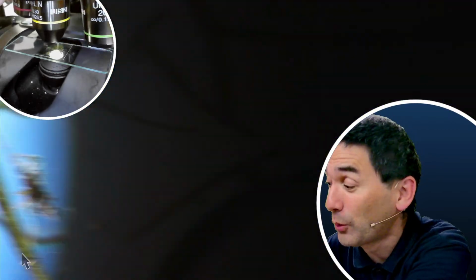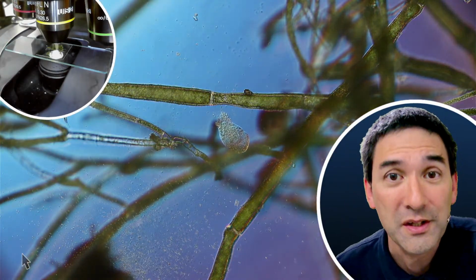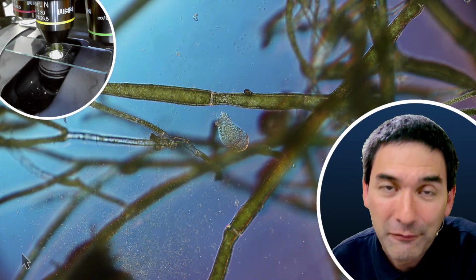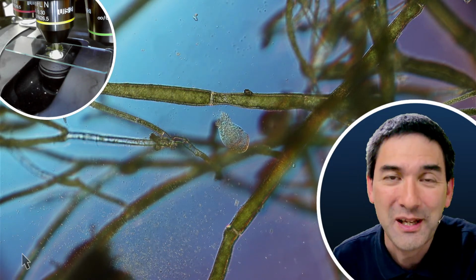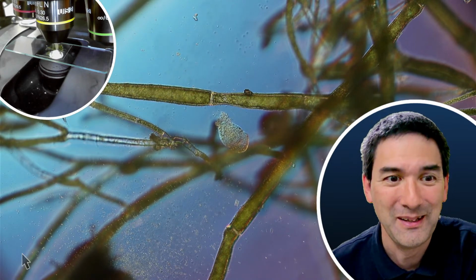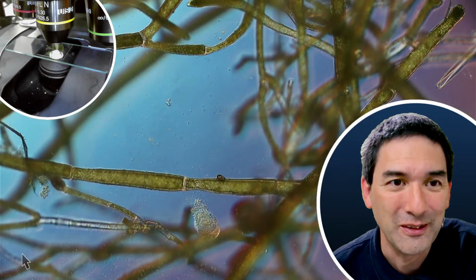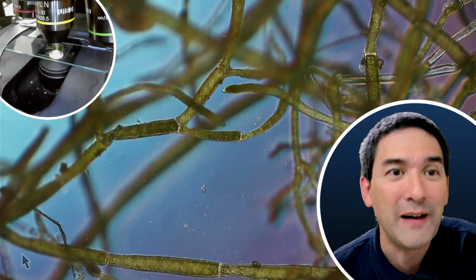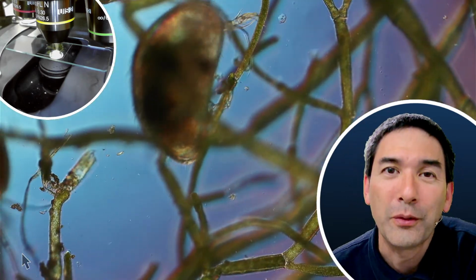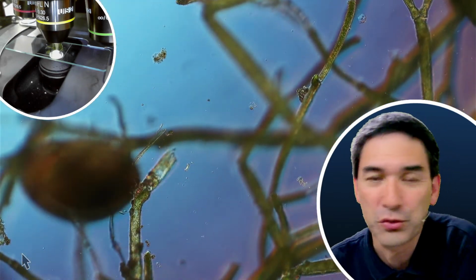But the question, of course, now begs the question: if these are actually small worms, microscopic worms, and you need a microscope, per definition they are actually not microorganisms, because the word microorganism kind of implies that they're single-celled. Yeah, it's a little bit of a question of definition. Some people also call viruses microorganisms, but strictly speaking, they're not organisms because they're not made of cells. Yeah, again, our ostracods here.